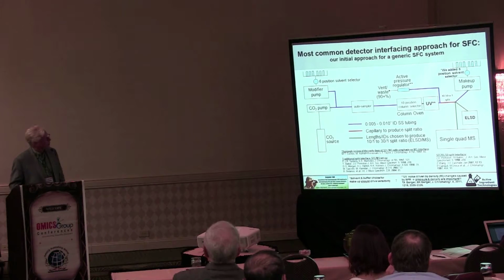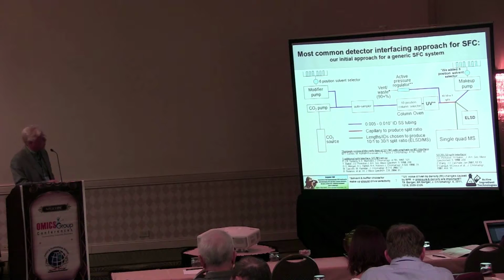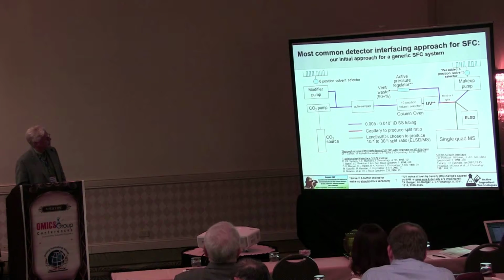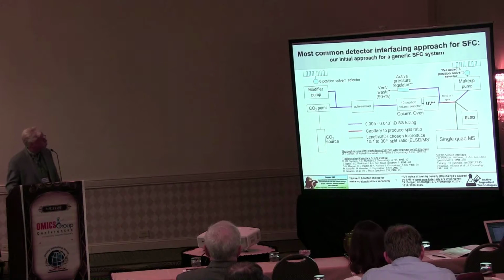Here's the typical approach. You have to regulate the pressure when you do SFC, right? So to maintain supercritical conditions, you have to regulate that pressure. And then the way you usually do the UV is at full pressure with a high pressure cell, and then you split what comes out of that and make that up with a solvent and go to either ELSD or mass spec or both. That's the way it's been done for a long time. You can get detection to work in those cases, but it's just not anywhere near what you can get on a day-to-day basis with reverse phase LC.